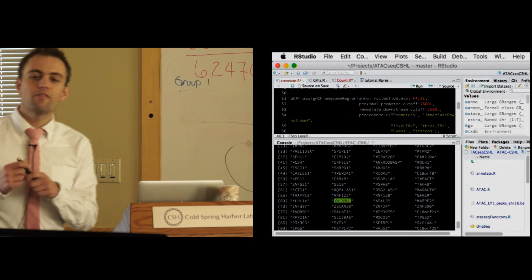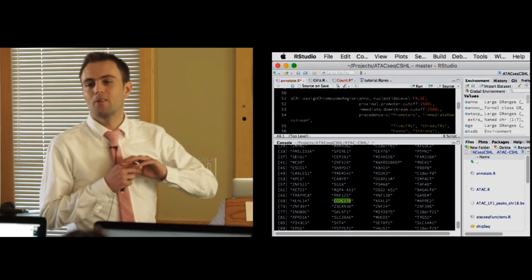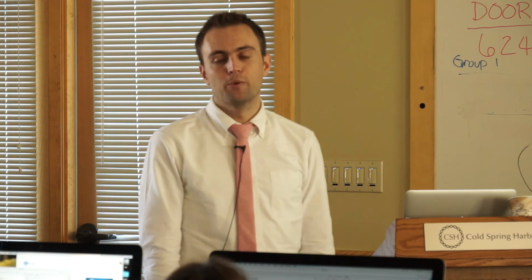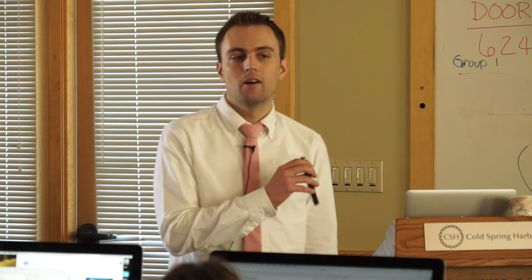Yes, quantifying is another great way to ask more questions. We can count reads, similar to RNA-seq, and compare. That gives us a number of read counts within a peak. There are all sorts of caveats to that and ways to deal with that data. I think there's a little bit of that towards the end of the tutorial.